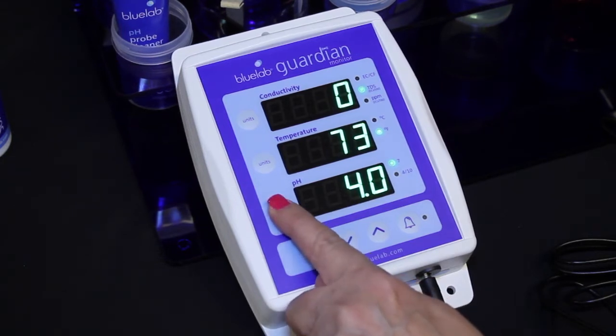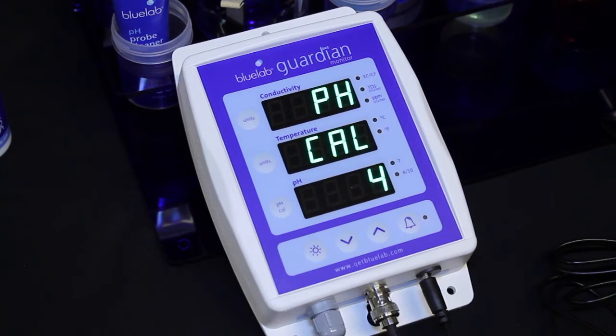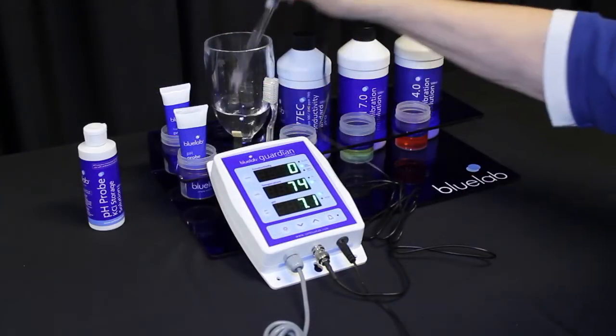Press and hold the pH cal button until pH and cal appear, then release. 4 will flash on the pH display, then the pH 4.0 indicator light will glow. Rinse the probe in clean tap water. You have successfully calibrated when you see both calibration indicator lights glowing.